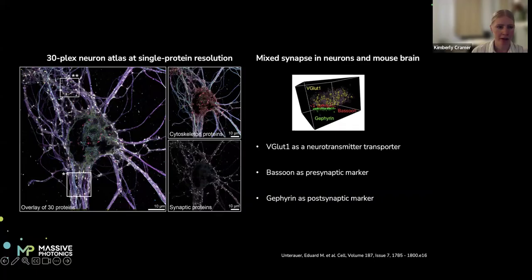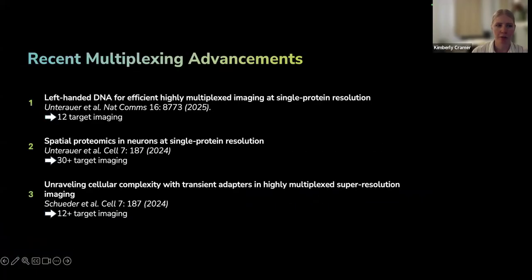So this is really exciting on the multiplexing front, but it's not the only recent multiplexing advancement. There were additional advancements lately, and I'm just putting this here. I want to highlight that DNA paint multiplexing is extremely capable, and you can really use this to look at tens of different targets in cells. Currently, the real limitation is actually binders or affinity reagents that work very well.